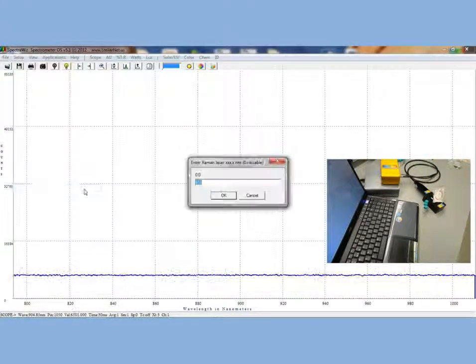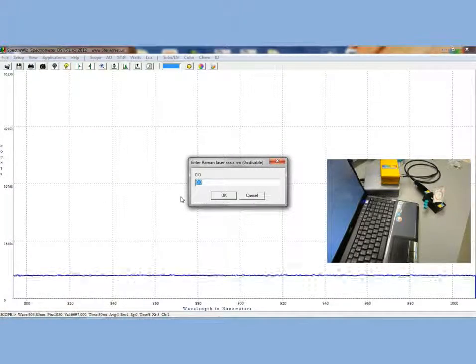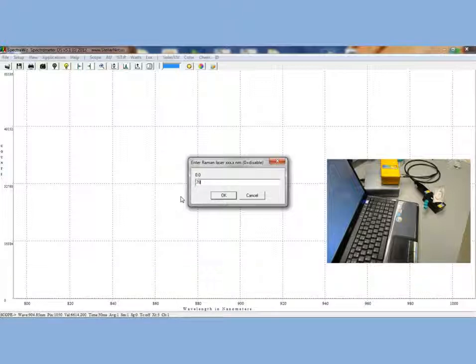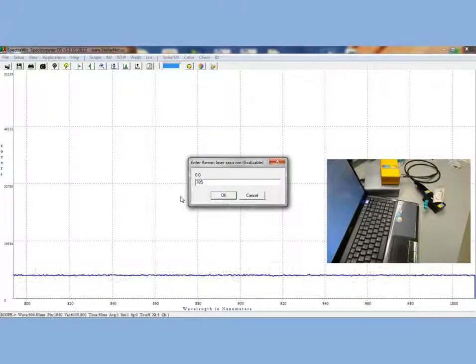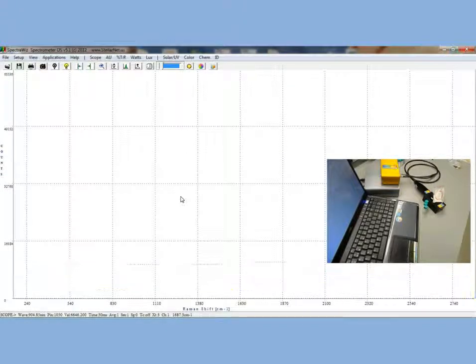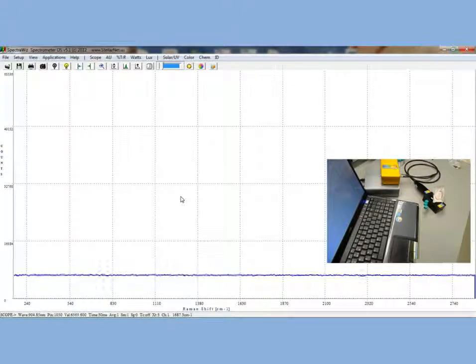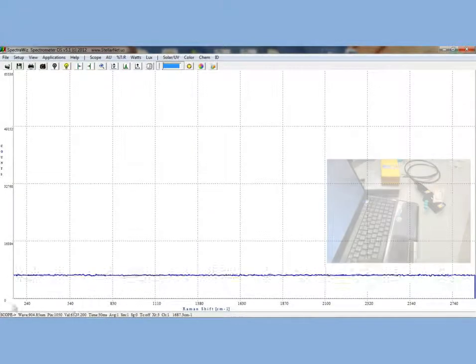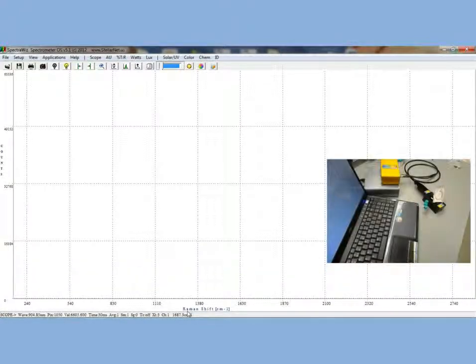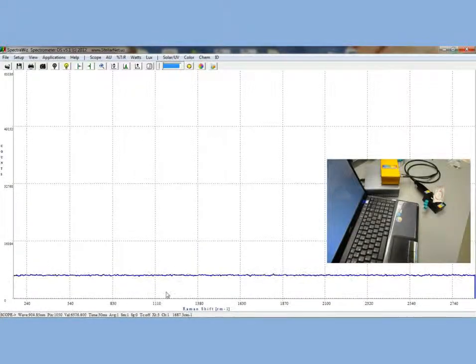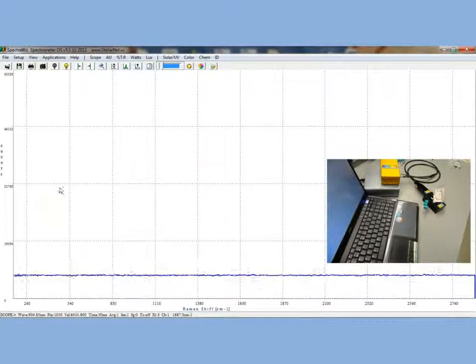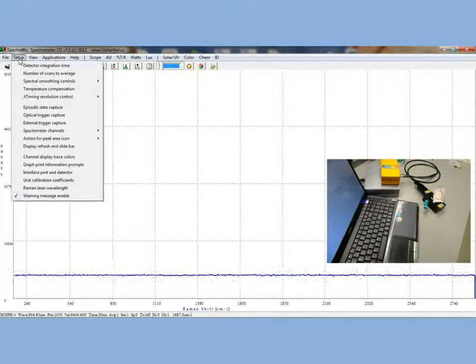We will be using the Spectrowiz software and we will demonstrate how to take some simple sample measurements. First, open the software and enter the Raman laser wavelength in the setup menu. Once you have done that, you will notice that the x-axis changes from wavelength to wave numbers.